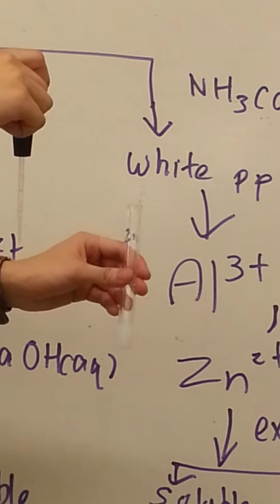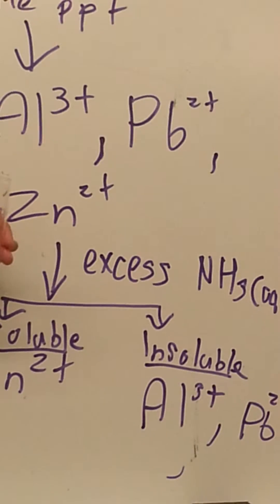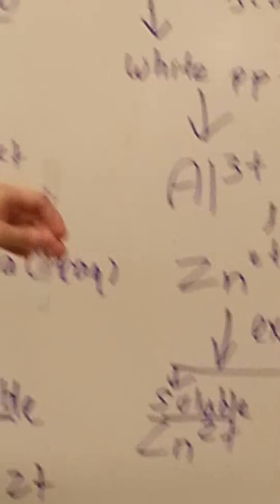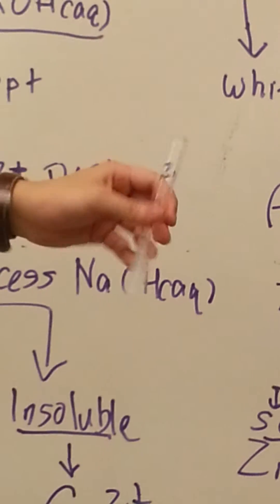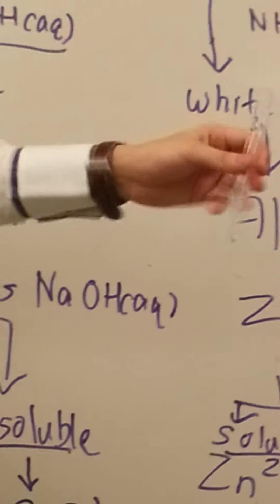Don't forget to shake after each reaction. Now I'll add an excess — excess means about half the test tube of aqueous ammonia. If you don't shake, there's a slower reaction — sorry, not no reaction, a slower reaction.